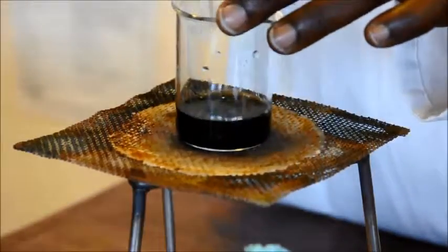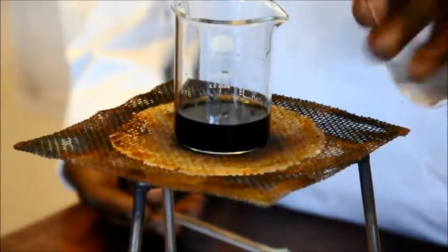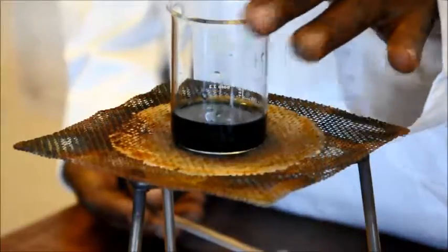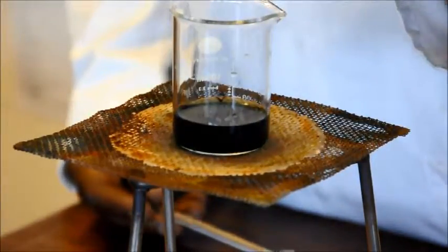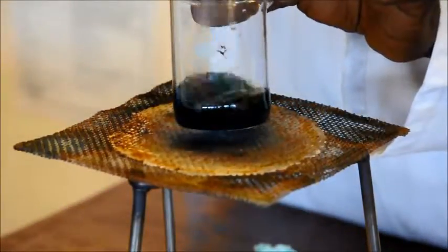Now the beaker, we've just been heating this, it can be quite hot. I'd suggest that you touch it to see it's not too hot for you to deal with. If it's not too hot to deal with, you carry on. If it's too hot to deal with, you just leave it till it cools a bit. So I'm happy with that. So a quick stir.